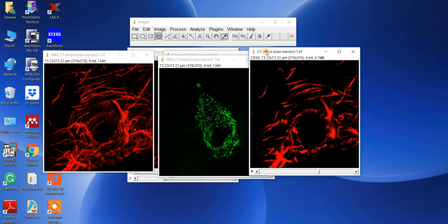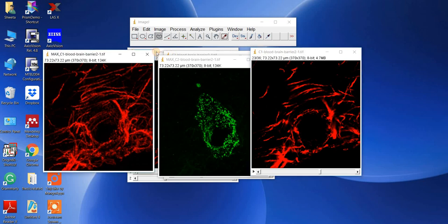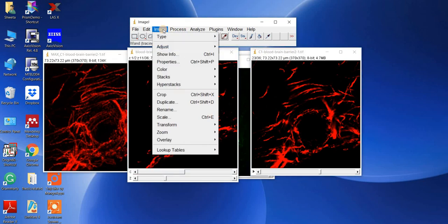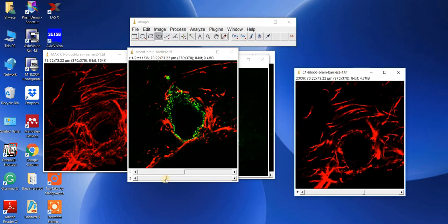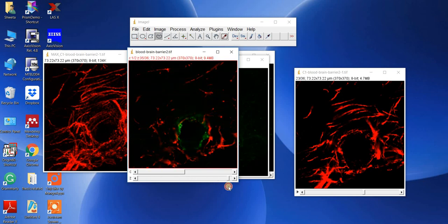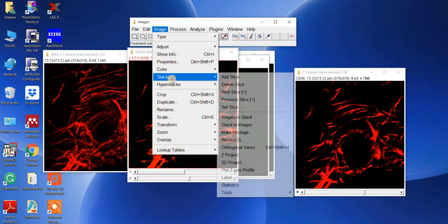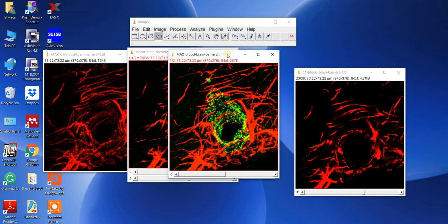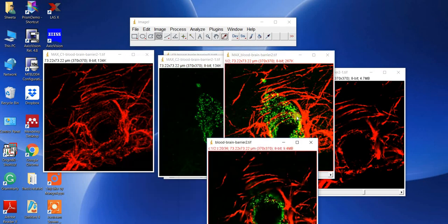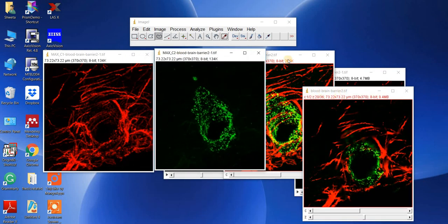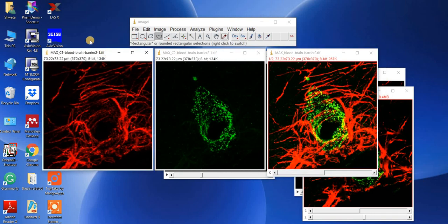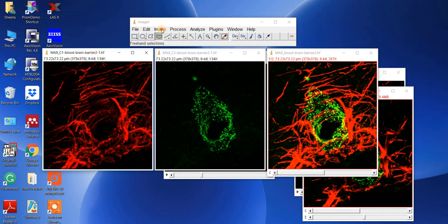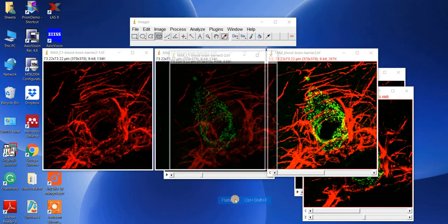Similarly, if you want to see the composite color image, take the duplicate image and go to Image, then Color, then Make Composite. Now you can see both channels — green and red — together. Then go to Image, Stack, Z-Projection to get the MIP of both channels together. For paper purposes, for each channel go to Image, then Overlay, then Flatten your images.